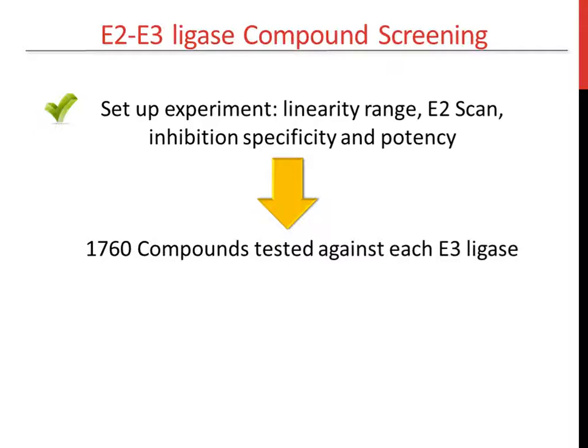But we wanted to show proof of concept that we can do screening with this, so we worked together with the drug discovery unit at Dundee University here in the UK, and they gave us 1,760 compounds, all FDA-approved drugs that are available, and we screened them against each of the three ligases.